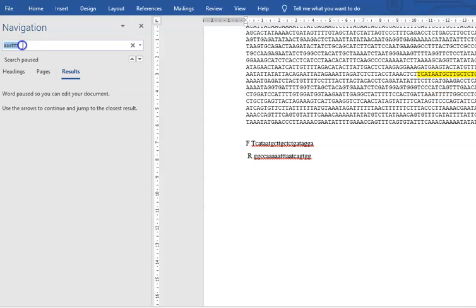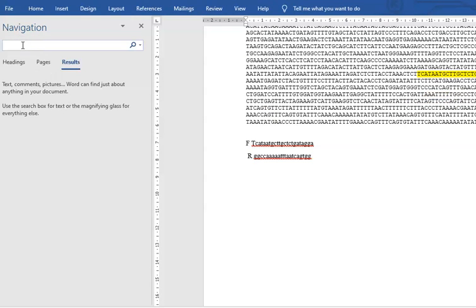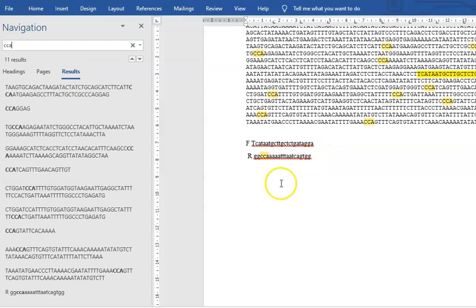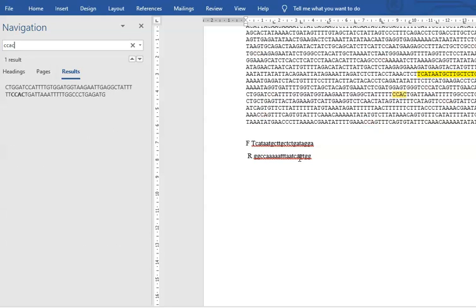So this is a search function which I've just moved the window very slightly, so I can type this sequence backwards and anti-sensing it. So where it says GGT, I'm reading backwards, I'll go CCA and then another C, then a T, G. Okay, so this is starting to match part of the sequence.